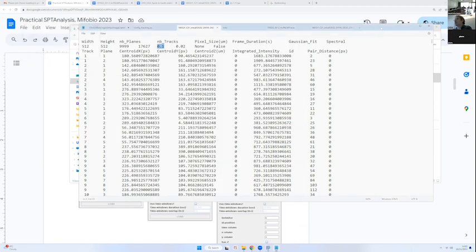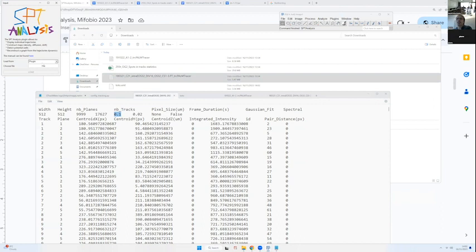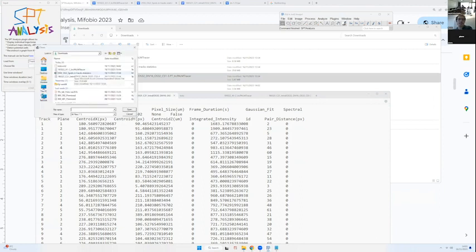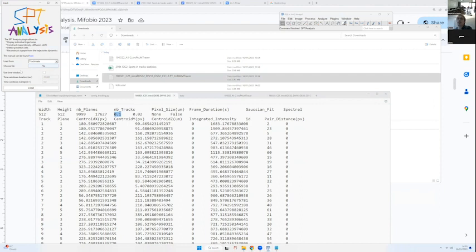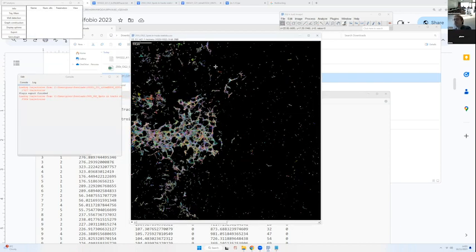So if now we just close all of it and reopen the plugin, so SPTanalysis, and now we choose TrackMate. Now we have much less options. So we can directly specify the dataset 2. So this dataset 2 is 293T OG2 spots in track statistics. And here we just have to determine if we want to use time windows or not. Let's say, okay, yeah, we want to use time window, same thing. And now we can just press load directly. So loading TrackMate files is very easy.